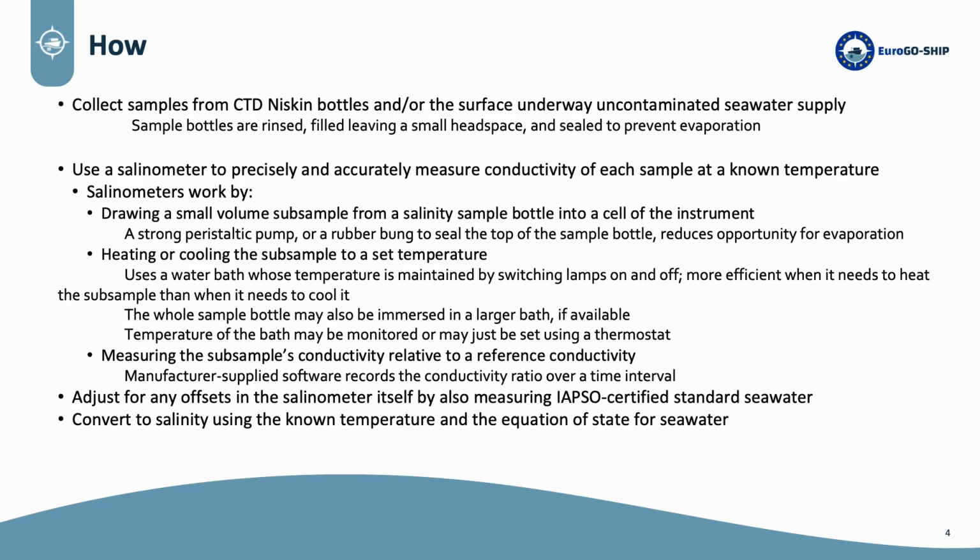First, I'll outline how we measure bottle salinity. Water samples to match to the sensor data are collected either from CTD Niskin bottles or from the surface seawater supply of the TSG. So the sample bottles need to be rinsed, then they're filled, leaving a small headspace, and then sealed to prevent evaporation.